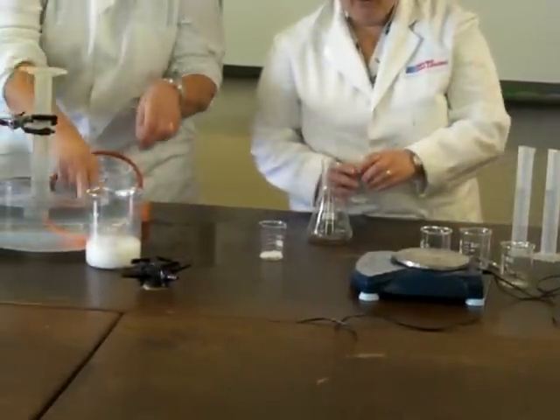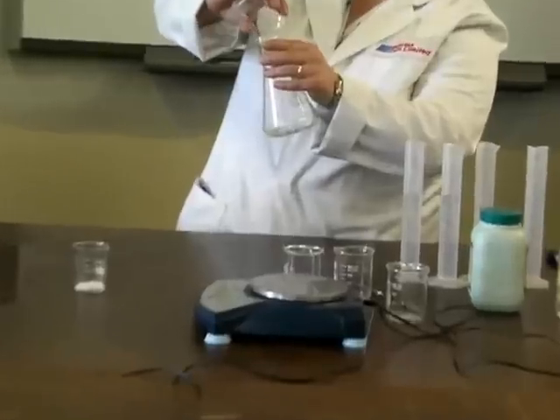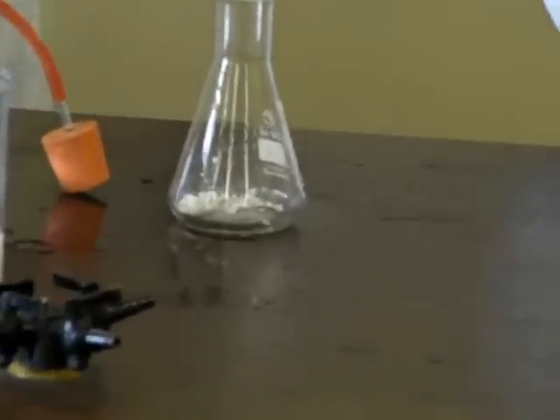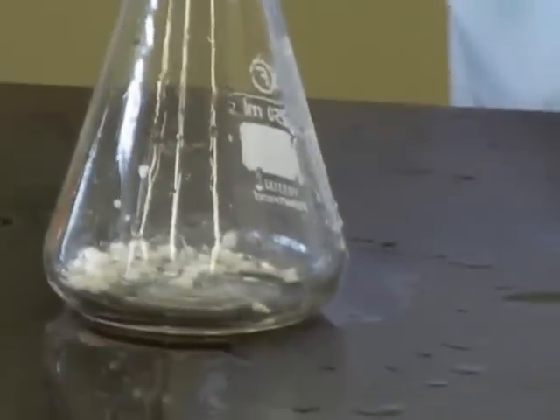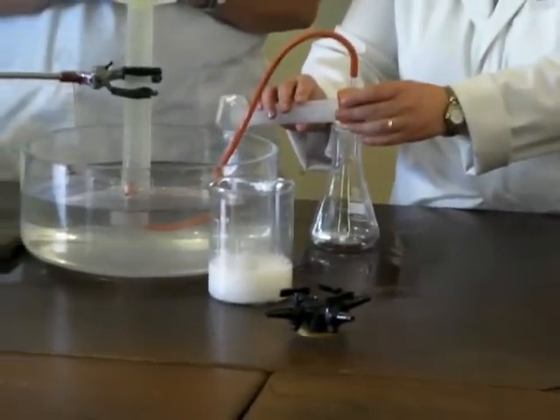So our fourth one, again, same conical flask that we've rinsed out to get rid of any excess acid. The best this time, got my chips stuck down the side. So our fourth experiment is 20 of the acid and 30 water. You ready, miss? 3, 2, 1.